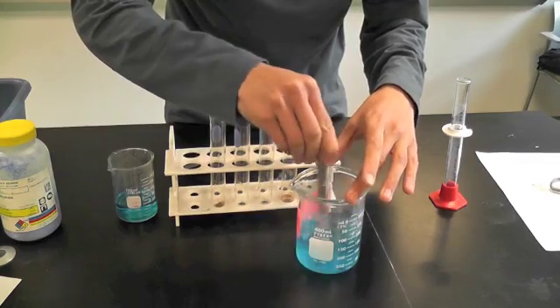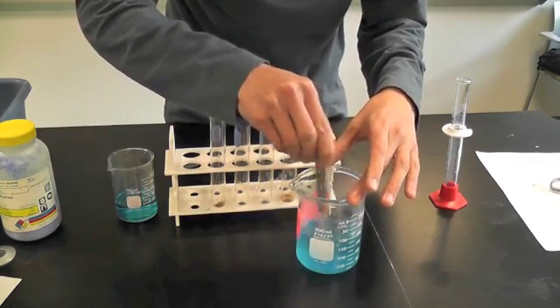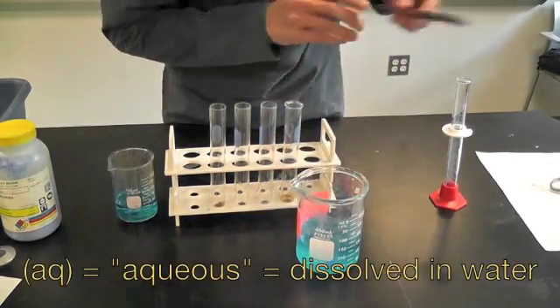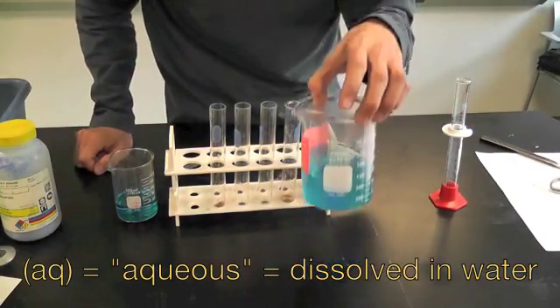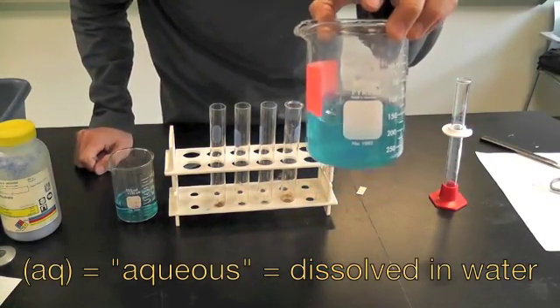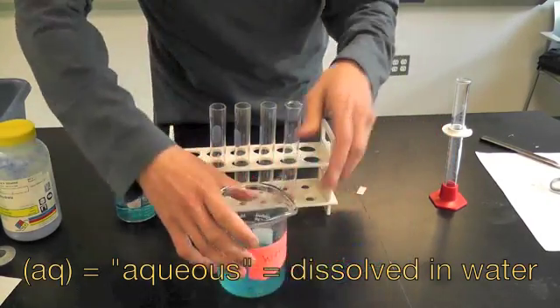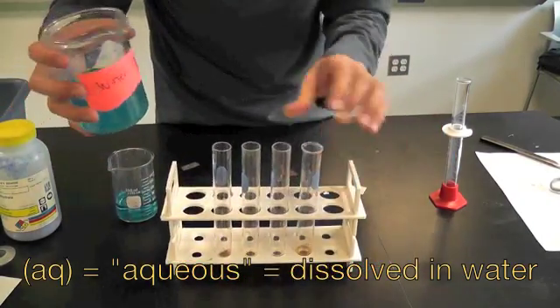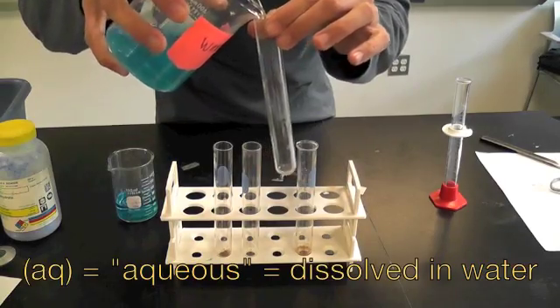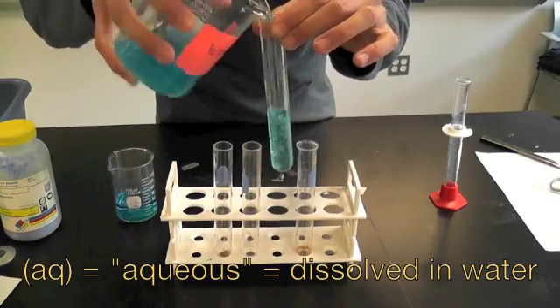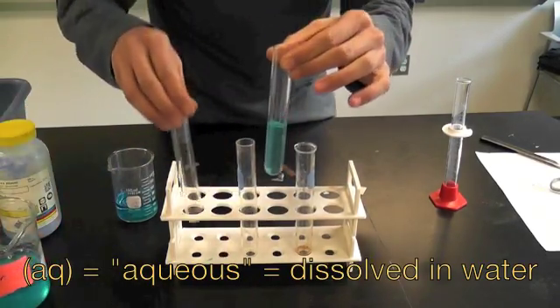As with many single replacement reactions, you have some solid metal, some elemental metal with some ionic compound in aqueous solution, AQ. That just means it's dissolved in water. So we'll take this copper nitrate solution and put it in a test tube. You don't need too much.